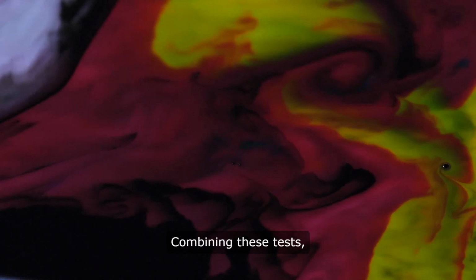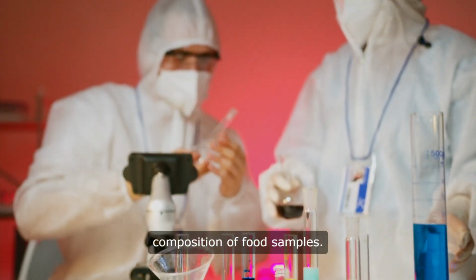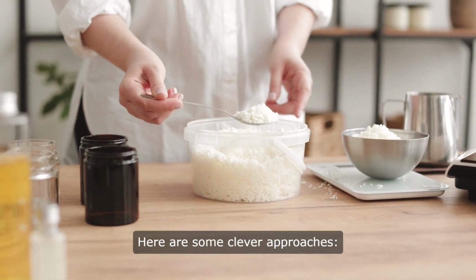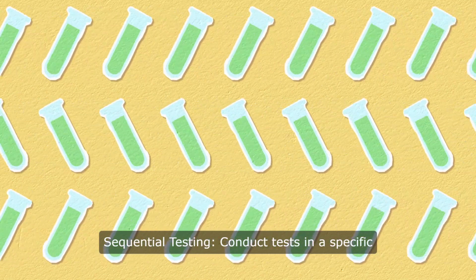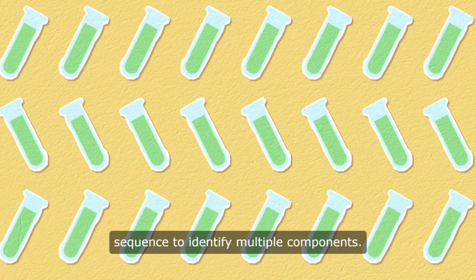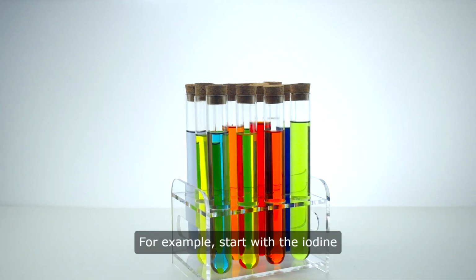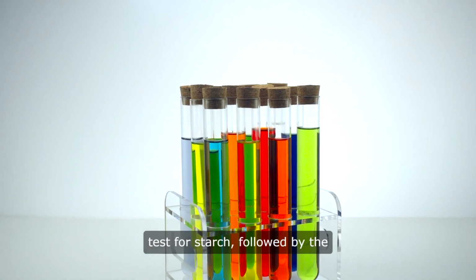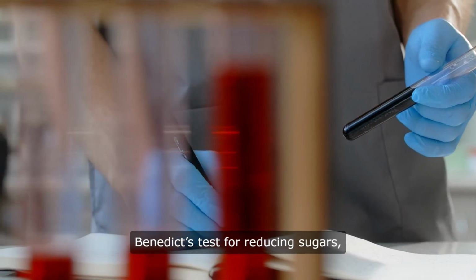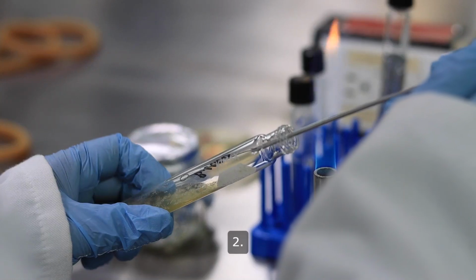Combining these tests, you can paint a comprehensive picture of the molecular composition of food samples. Here are some clever approaches. 1. Sequential testing. Conduct tests in a specific sequence to identify multiple components. For example, start with the iodine test for starch, followed by the Benedict's test for reducing sugars, and then the Biuret test for proteins.